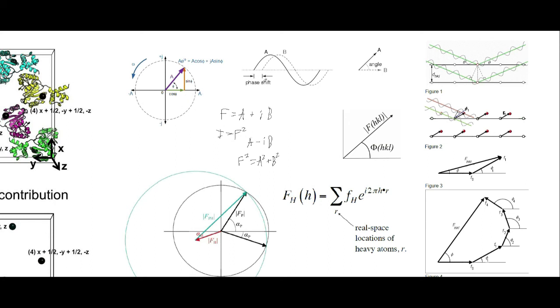is, so you can see here a phase shift. So the phase shift can be thought of in a complex space as the angle that the vector, this vector here, is pointing, but we don't know the phase, so this could be anywhere along the circle. This phase shift could be offset by any number of degrees. So the phase shift between A and B here is shown as an angle here between A and B.